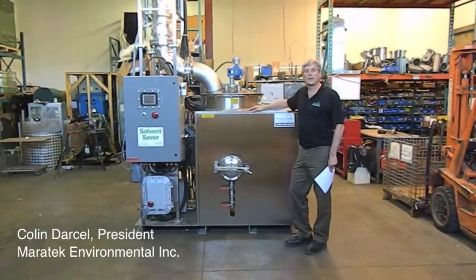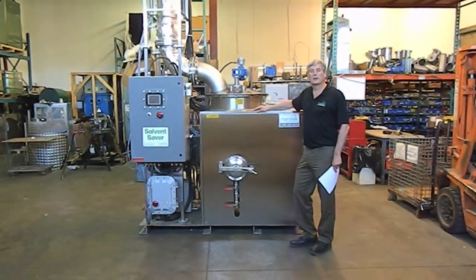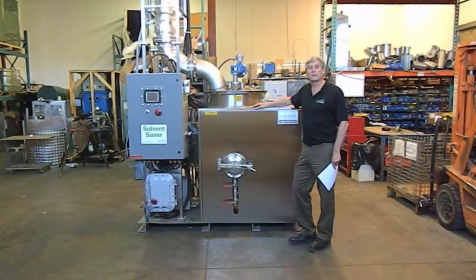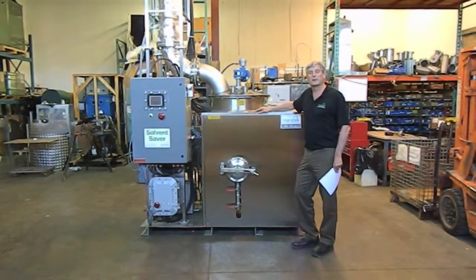Hi, my name is Colin Darcel. I'm the president of Maratek Environmental. We're the manufacturer of off-the-shelf solvent recyclers and also custom engineered and fractional distillation recycling systems.